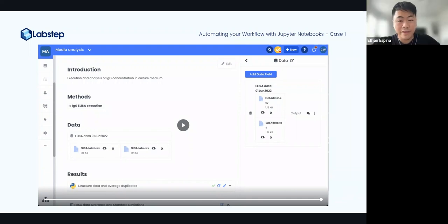Right. And in a similar vein, can you run it in the background whilst, for example, I'm running another experiment? Yeah, absolutely. And you could have multiple scripts running at the same time. For each script you have, it will launch a new Jupyter server. So you can have multiple things running, and that's fine. It will just execute them all in turn.